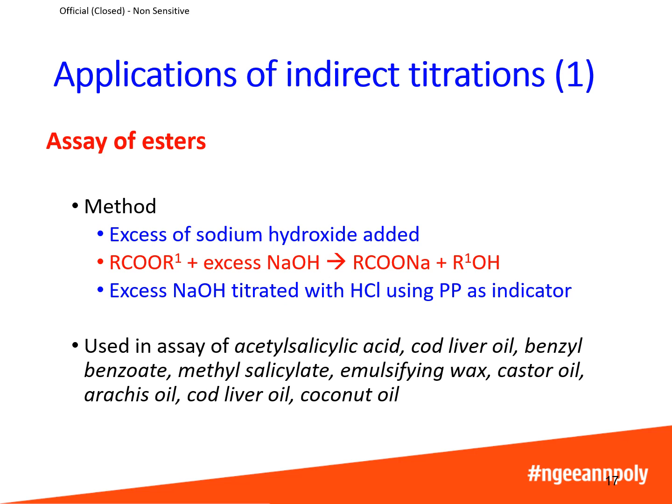And at the end, the excess remaining sodium hydroxide is titrated using HCl and phenolphthalein as an indicator. This assay is used for the assay of different esters, for example, acetyl salicylic acid, cod liver oil, benzyl benzoate, and so on.